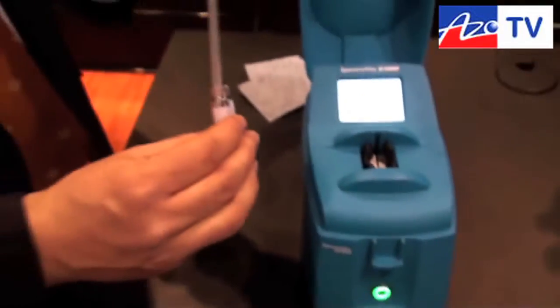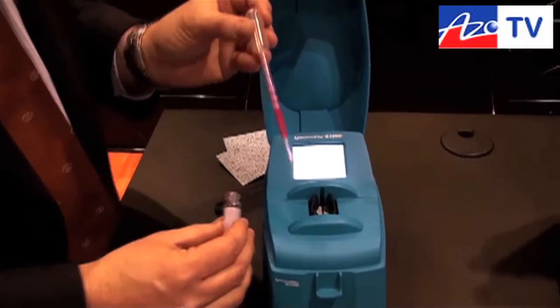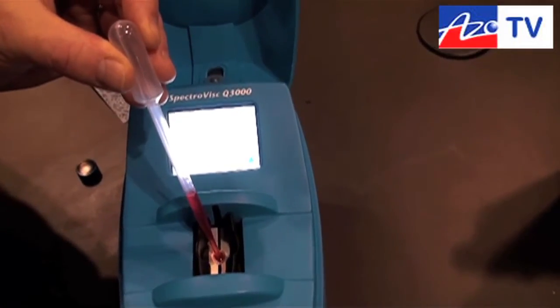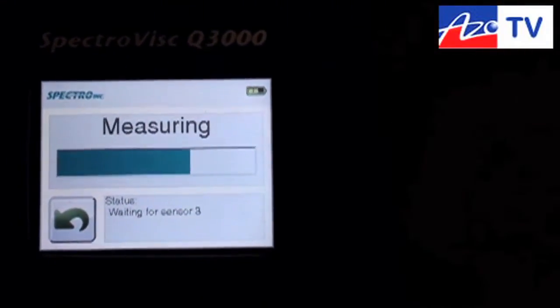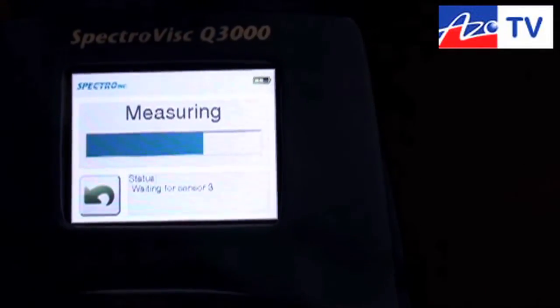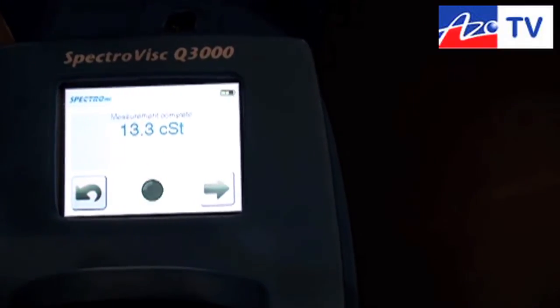While it's warming up, it asks us to load the sample. So I'm going to take a little bit of sample and simply introduce it into the chamber. Immediately, as soon as the sample hits the sensors, it starts to measure. It's flowing down a capillary cell and it has timers on there, so as the fluid flows down it's measuring the timing. The principle of the system is known as the Hele-Shaw viscosity technique, which essentially states that the velocity of fluid flowing down between two parallel plates is related to the viscosity of the fluid.